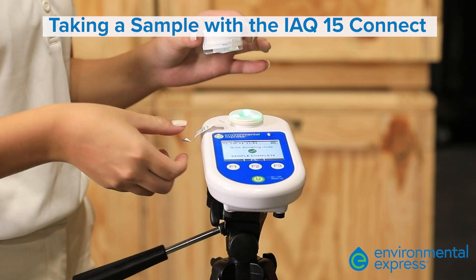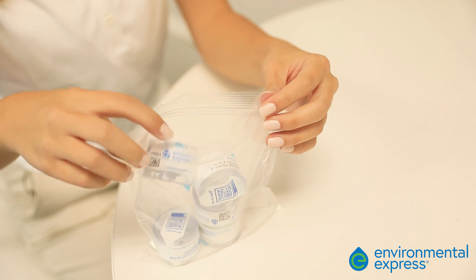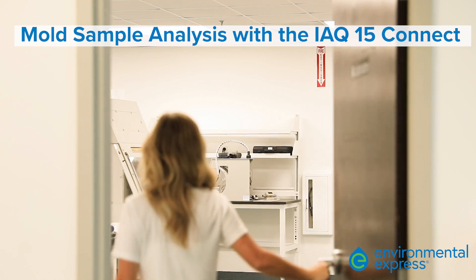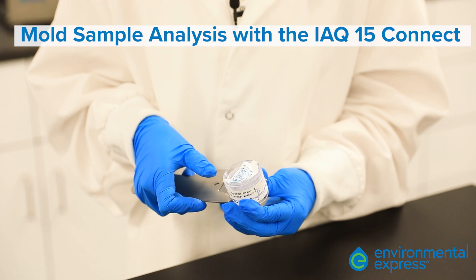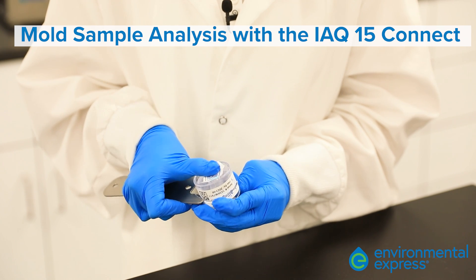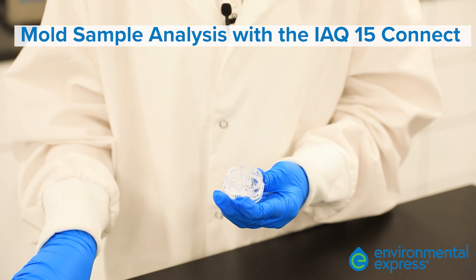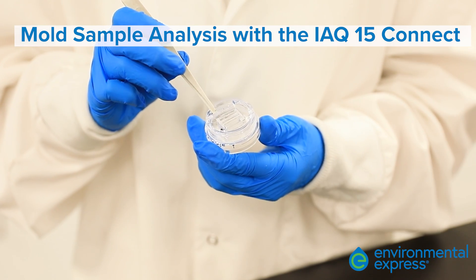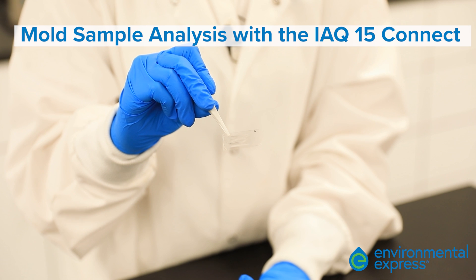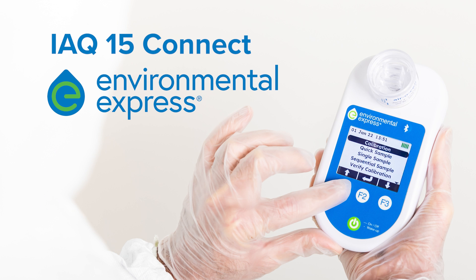Remove the cassette and reattach sticker tabs to both the top and bottom of the cassette. Place the aerosol sample into a sealed bag to protect the integrity of the collected sample. The sample with a chain of custody form is ready to be sent to a lab for testing. In the lab, the aerosol will be tested. During analysis, the slide will be removed from the cassette. Careful handling is required to avoid cross-contamination from external sources. Analysts will then evaluate the sample slide using microscopy.